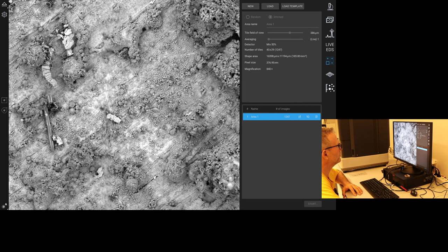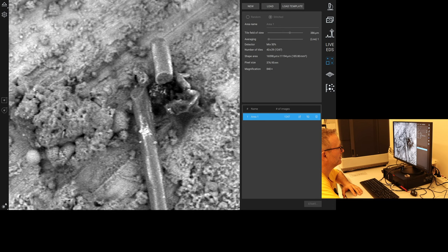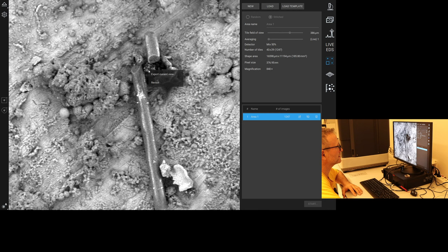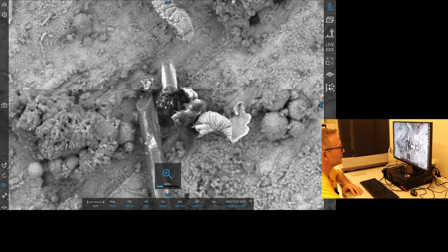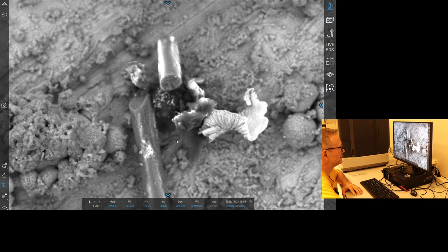What is this? This looks interesting. This looks like a carbon sphere in the center of here. This looks mighty interesting. Let's go here. These look like they might move around with a bit too much power on them, unfortunately. Okay, look at that. What have we got in there? That's moving around. Don't move. Stay there.